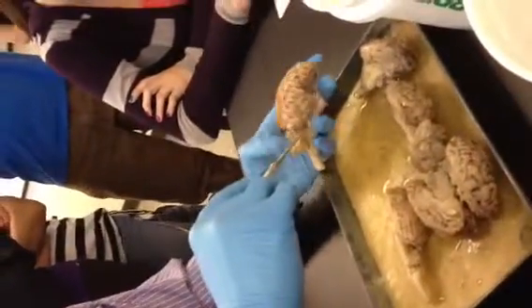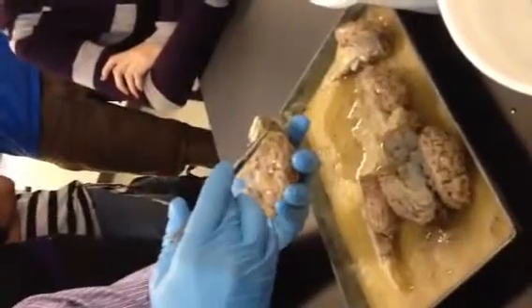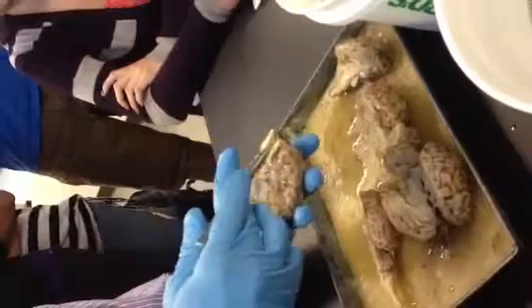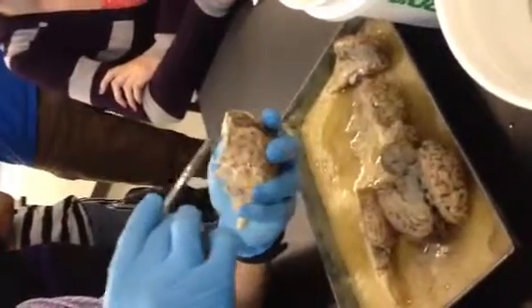Ventral structures, olfactory bulbs. This is a good brain to show this. These are the ones for smell. The two olfactory bulbs are these big white things here and here. Olfactory bulbs there and there.